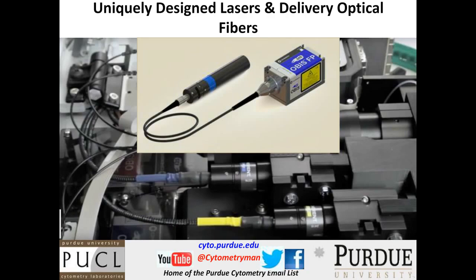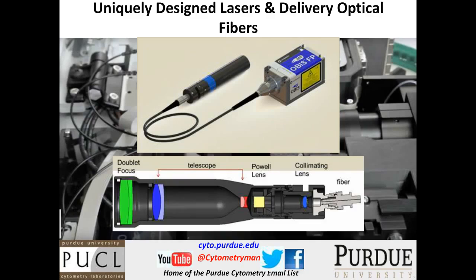And the first feature is that it's fiber optic delivered into this big blob here. And the question is, what is in that blob? So let me clear all these marks that I've made on here so we can look at this optical device. There's a number of features.